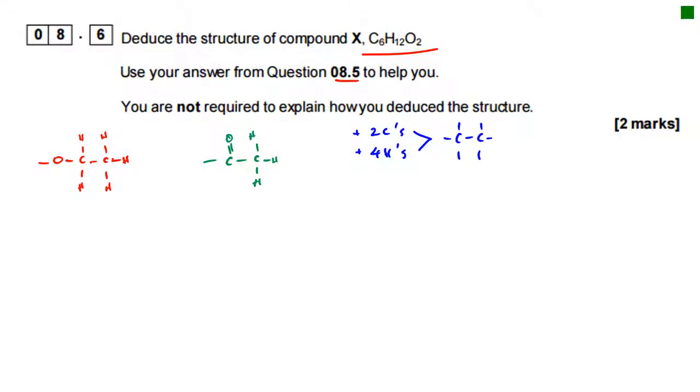Okay, the other thing that I point out is that CH3 groups are usually the ends of molecules, aren't they? Alright, can't go any further. Alright, so we have to turn one of these round. Let's turn the red one round. Alright, so we'll draw our CH3 on the left this time, next to our CH2, next to our oxygen.